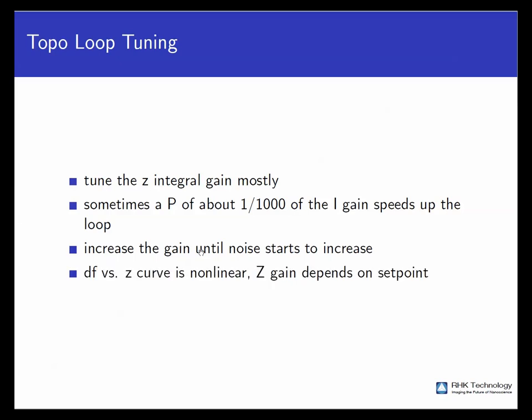You should keep in mind while doing this that the Z gain, as I said earlier, depends on the set point. If you increase the set point, you most likely have to decrease the gain.